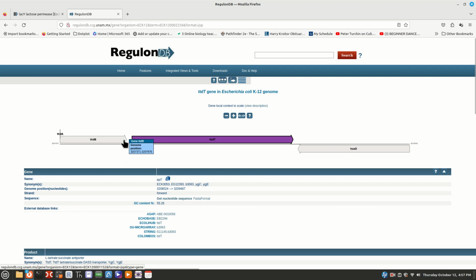So this one ends at 76 and this one begins at 24, so 976. Yeah, so there are probably about 50 base pairs in between here. You'll have to go find those 50 base pairs out of the entire genome, and you'll have to search for that to get that piece in between. And I can assure you that piece in between is going to be needed. So make sure you get some overlap for these. If you don't find them here, you need to find them elsewhere.